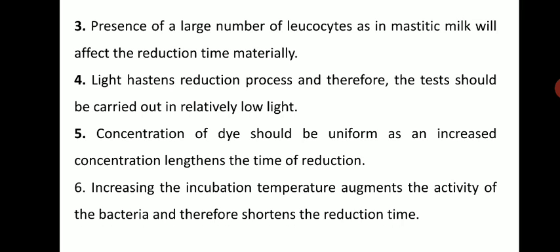The concentration of dye should be uniform, as increased concentration lengthens the time of reduction. In this test, you have to keep the concentration of dye uniform. Increasing the incubation temperature augments the activity of bacteria and therefore shortens the reduction time, so incubation temperature is again an important factor.